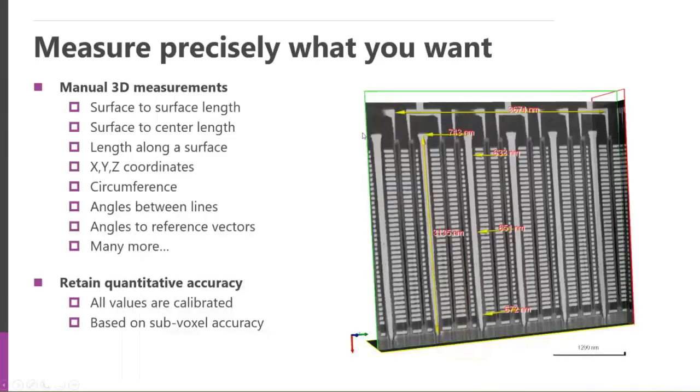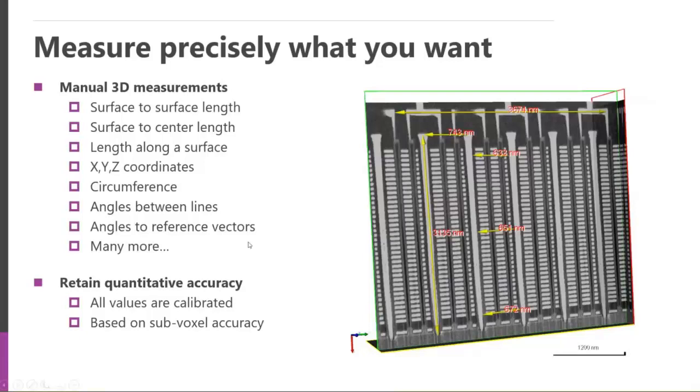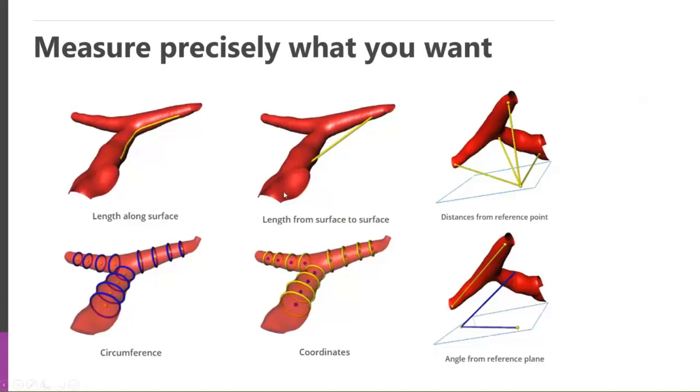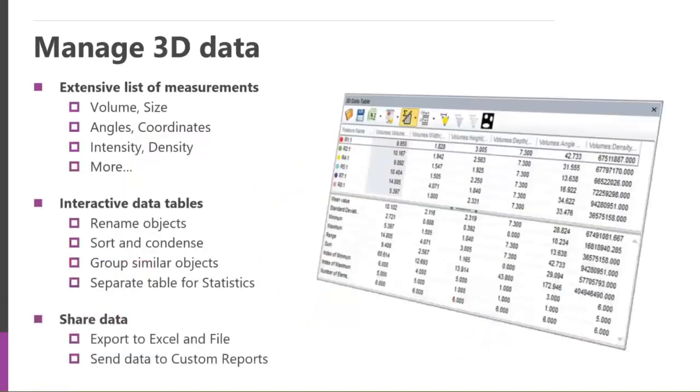And in addition to rendering and doing volumetric measurements, like in 2D, we can make manual measurements too in the 3D space where we can make lines, lengths, areas, and things like that. And that's very powerful. We can measure, making exactly the type of measurement that you want to make in the 3D world, measuring along surfaces from points to points, distances from certain relative planes, measuring angles, and all these kind of good things. So these are all measurements that we can kind of keep in mind that we're able to do with the ImagePro 3 module running within the ImagePro version 10 software.